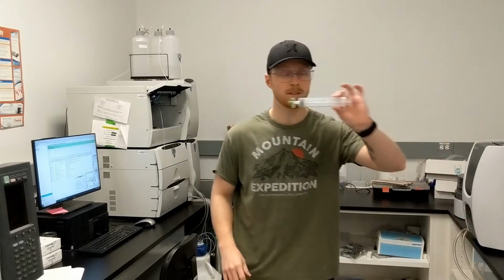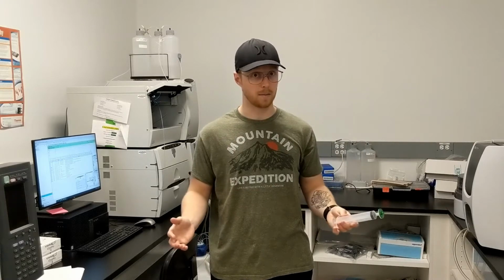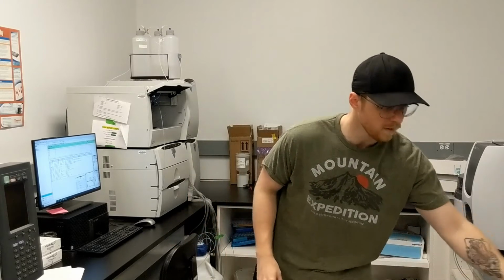One way that you can filter is with these syringe filters. It needs to be at least 0.45 micron. It can be smaller, like 0.2. Sometimes you can vacuum filter and sometimes you can centrifuge. But talk to the people who manage your IC to make sure that that's okay first.